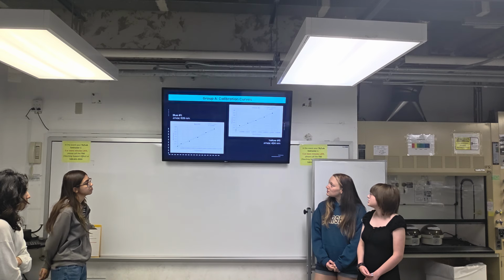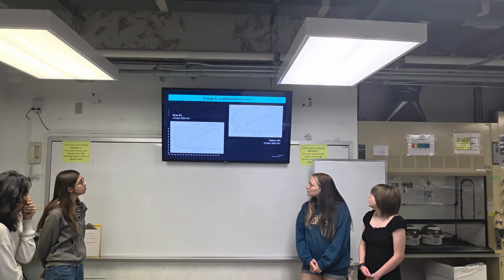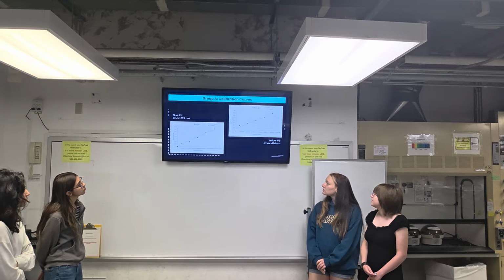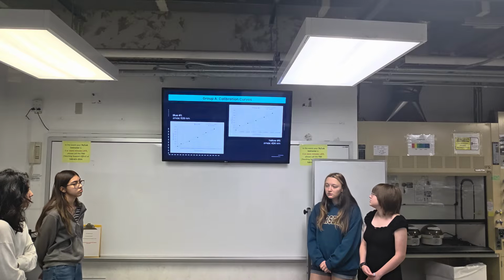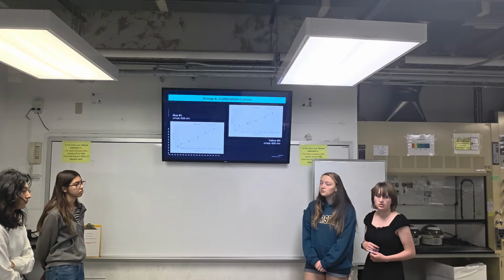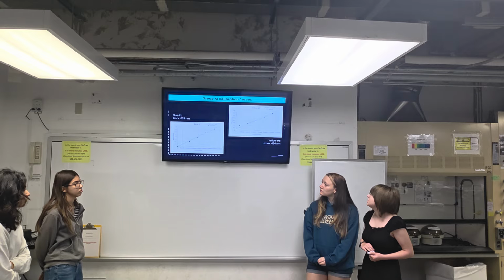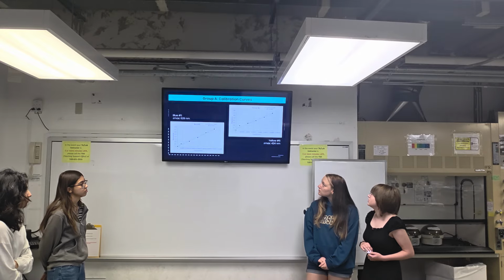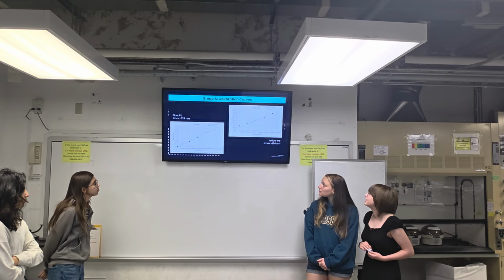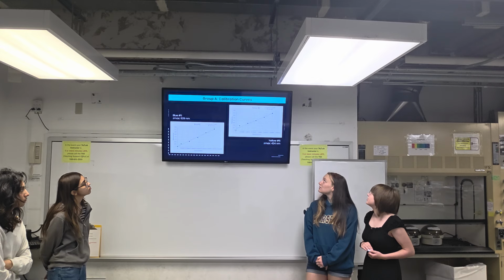And then here were calibration curves that we made by comparing the absorbances with the concentrations. You can see some of the dots on yellow number 5 are kind of off. I think that's just because we had a little bit of issues with the volume when we were putting the liquid in the cuvettes, but we'll talk about that more later. And then we have our slopes on here. For blue, it was 587.585, and for yellow, it was 21,946.